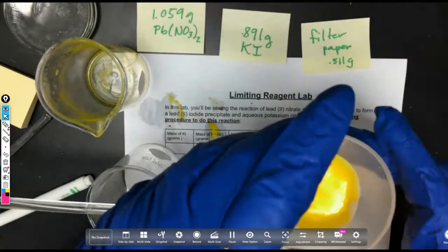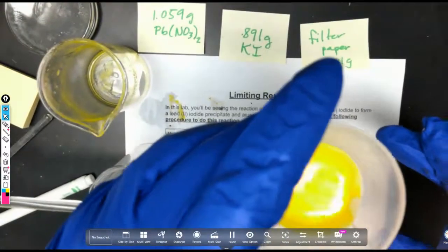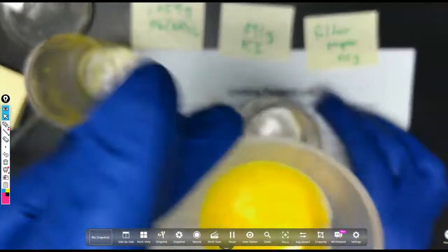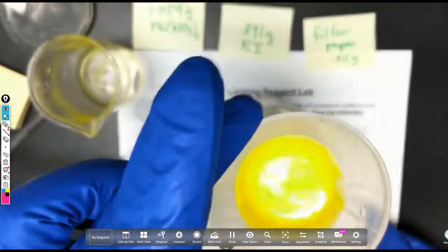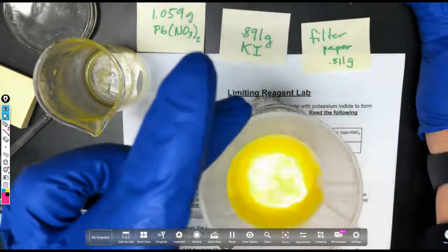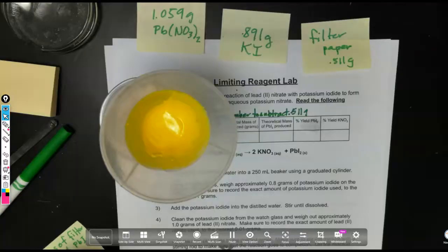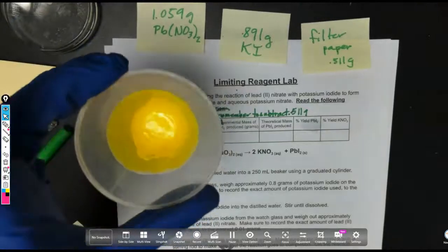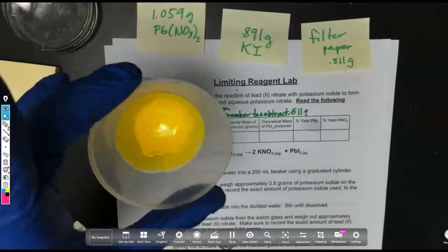All right, I'm going to pause it once again while it finishes up with its filtering process, but as you can see, we are getting a clear liquid and a yellow solid. Okay, we have reached the end of our filtering, and as you can see, we have a filter paper that is full of a yellow solid.